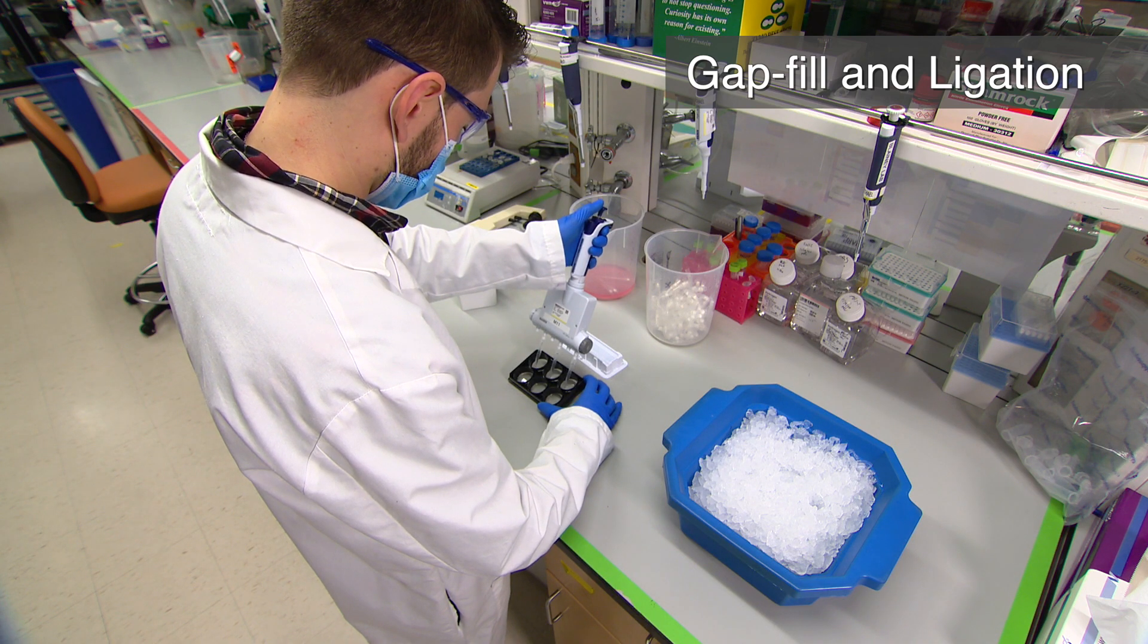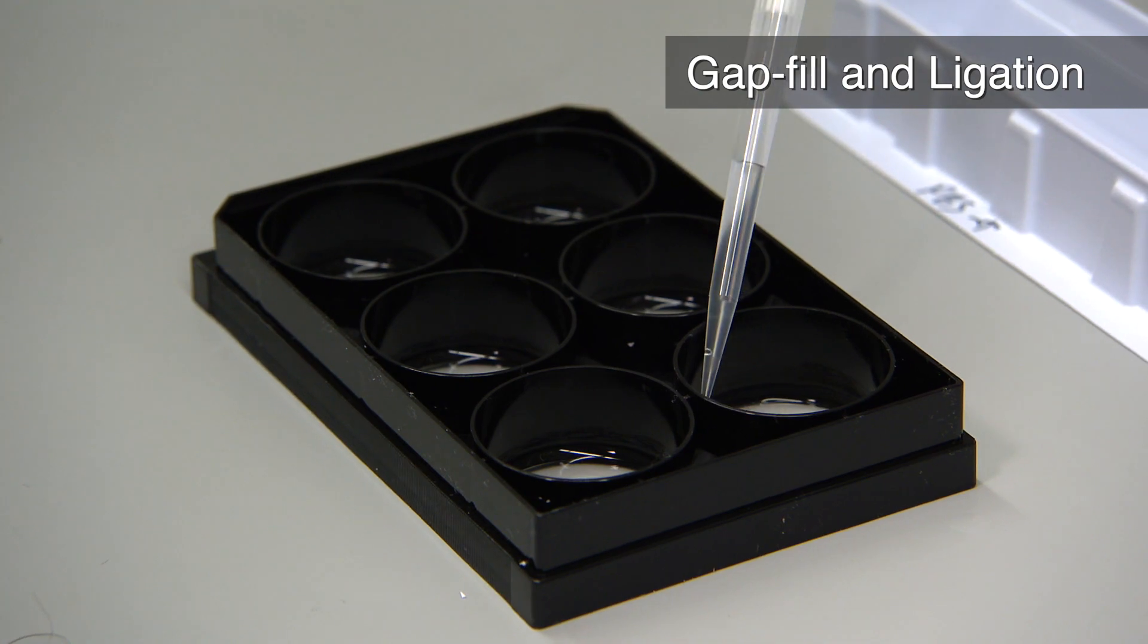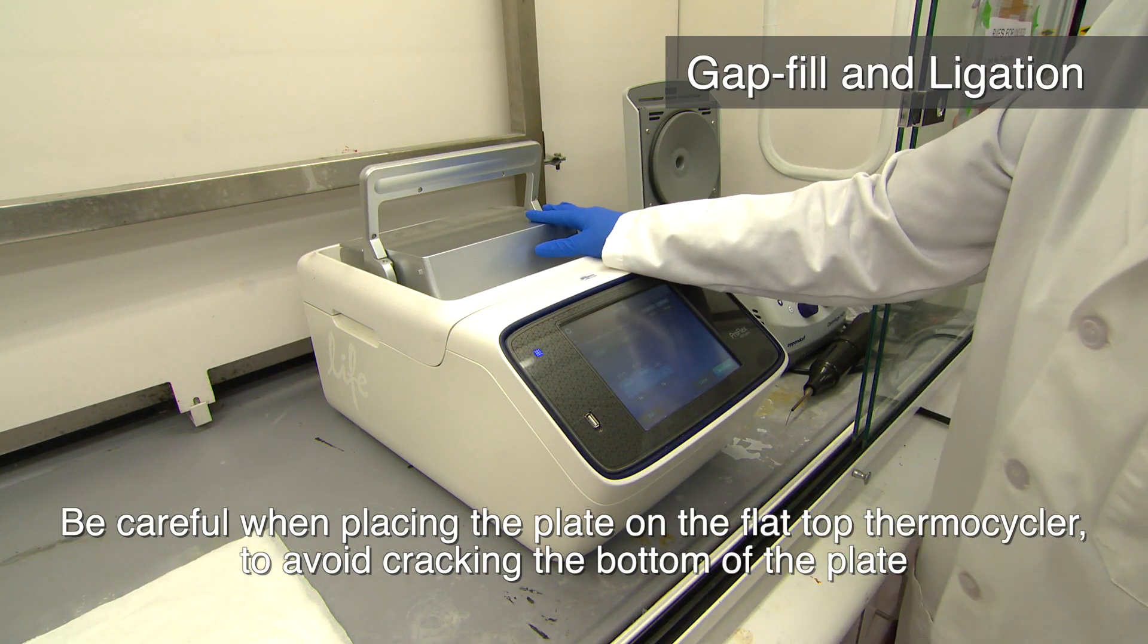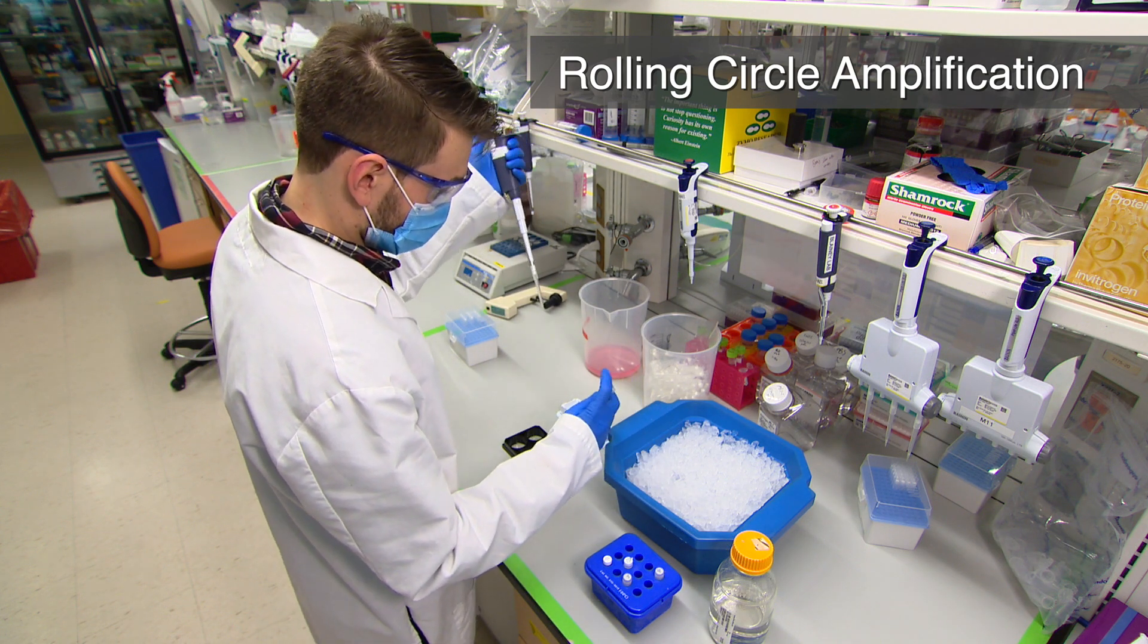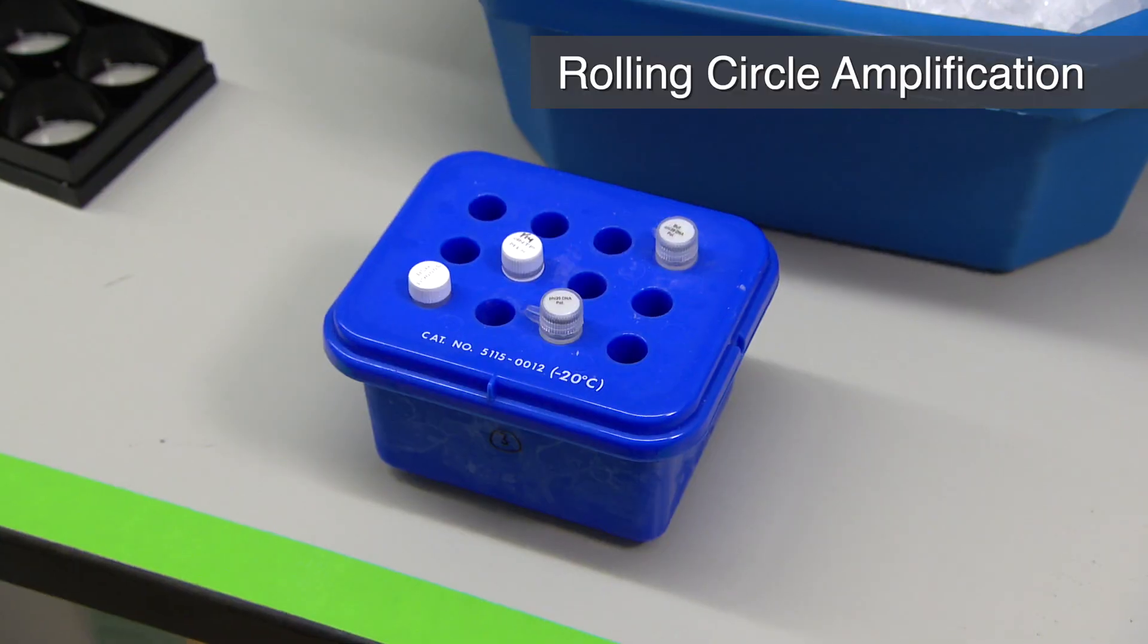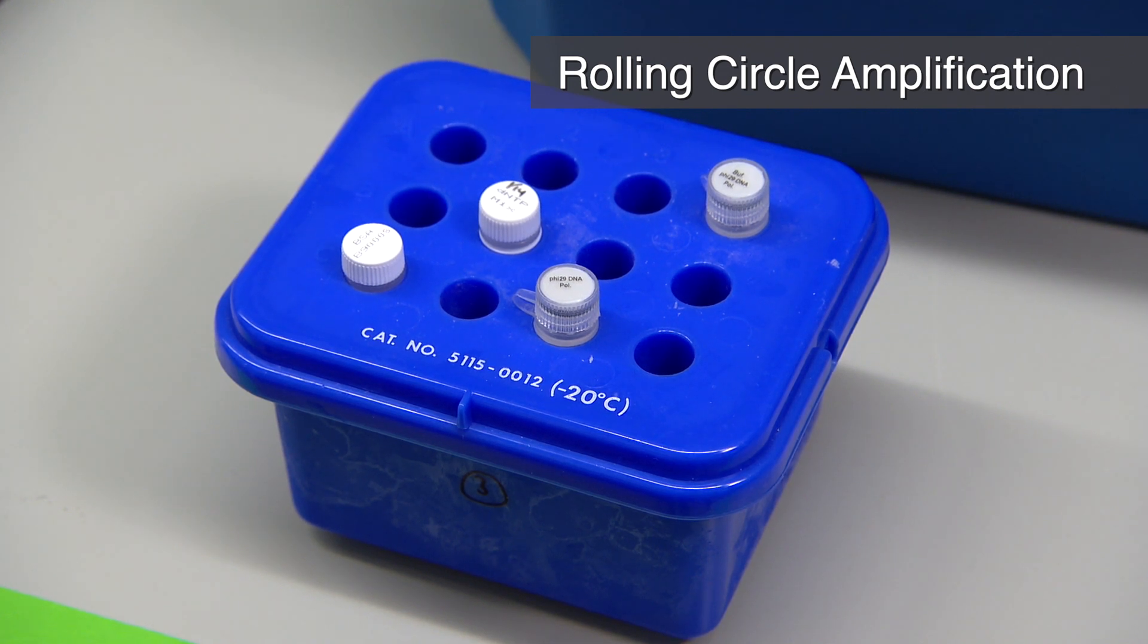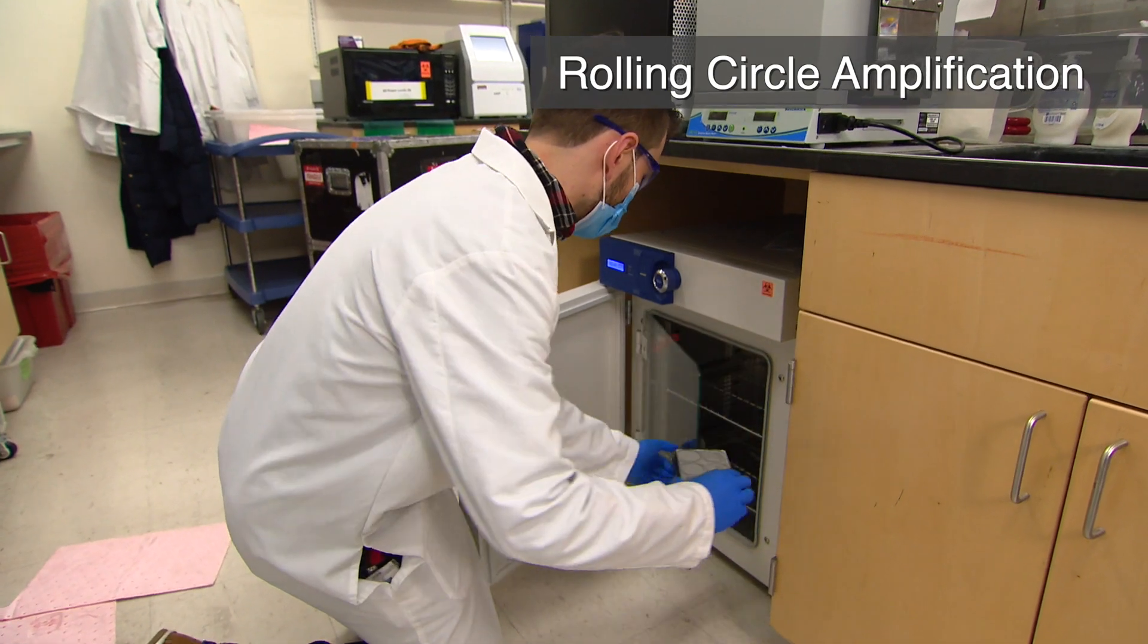Wash 3 times with PBS-T and add 500 microliters of gap-fill reaction mix to each well. Place the plate on a flat-topped thermocycler and heat for 5 minutes at 37C, then 90 minutes at 45C. Wash 3 times with PBS-T and add 500 microliters of RCA reaction mix to each well. Avoid thawing Phi-29 unnecessarily as it is a sensitive enzyme. We generally keep it in a pre-chilled bench-topped cooler and minimize time outside of the freezer. Incubate at 30C overnight.